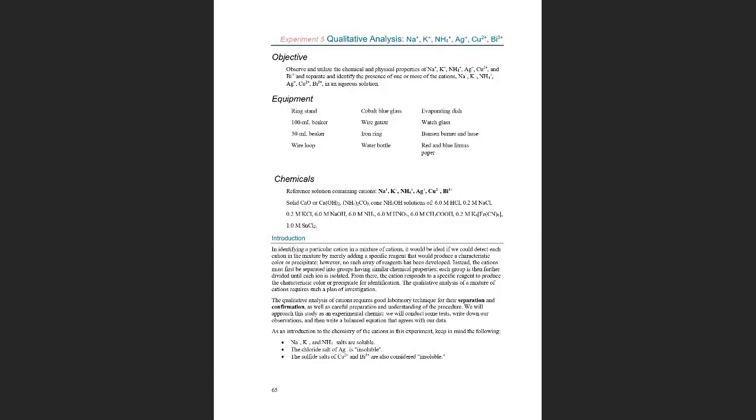So now that you saw me, Miss Mann, we are going to start. What is qualitative analysis? Qualitative analysis is the separation and identification of substances. That's simple.